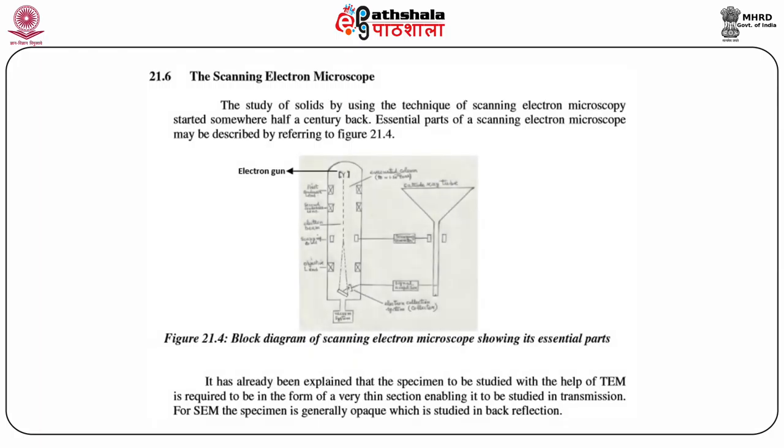The scanning electron microscope. The study of solids by using the technique of scanning electron microscopy started somewhere half a century back. Essential parts of a scanning electron microscope may be described by referring to figure 21.4, which is a block diagram of the scanning electron microscope showing its essential parts.